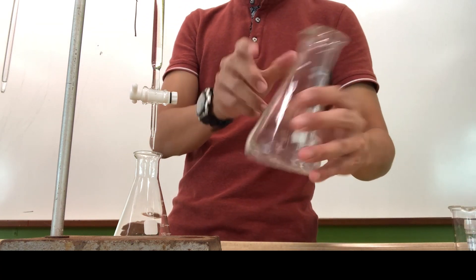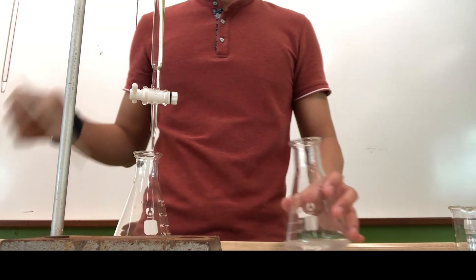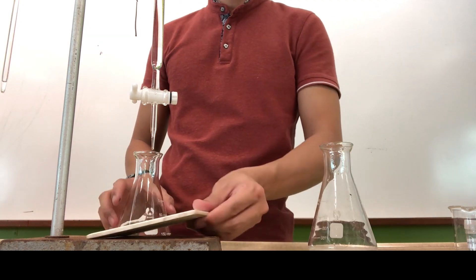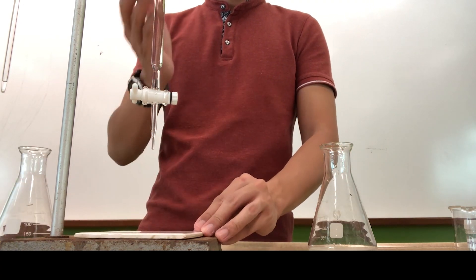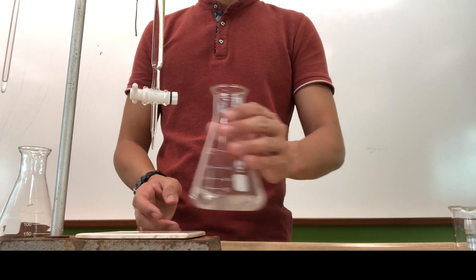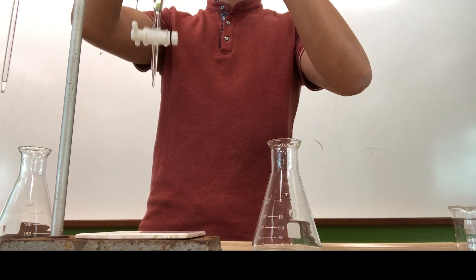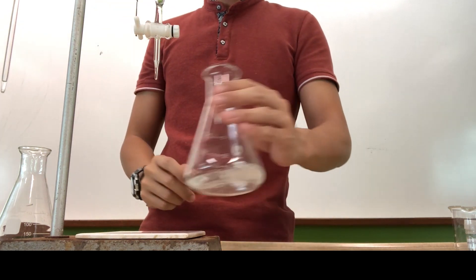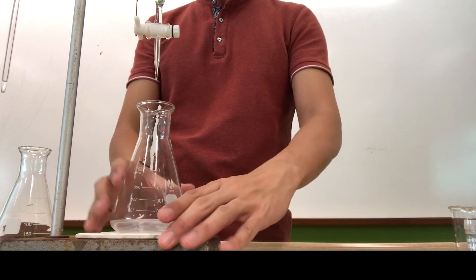Swirl it around to make sure that it is mixed well, and then place it on top of a white tile below your burette. Do ensure that your burette is being adjusted accordingly, so that the conical flask is already below it with the tip of the burette just slightly inside the conical flask.